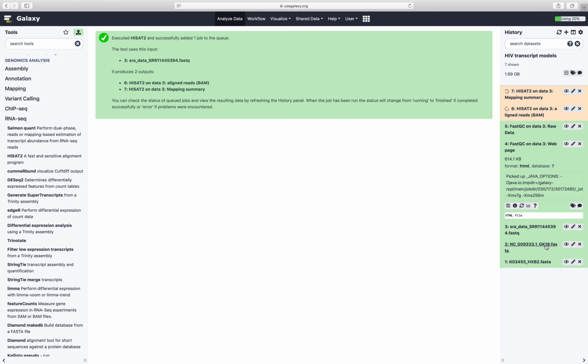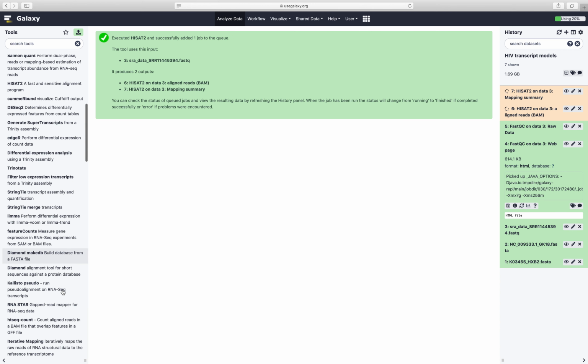And then what we can also start to do is we have those GFF3 files, and we have some other annotation files, so we can start to look at gene expression from the virus, and then we can also go back and look at the host. But the host is a big genome, so that will require paying attention to how we can work with the smaller virus genomes, and then we can tackle the host genome at a later date. But we don't need to do that for our immediate goals.